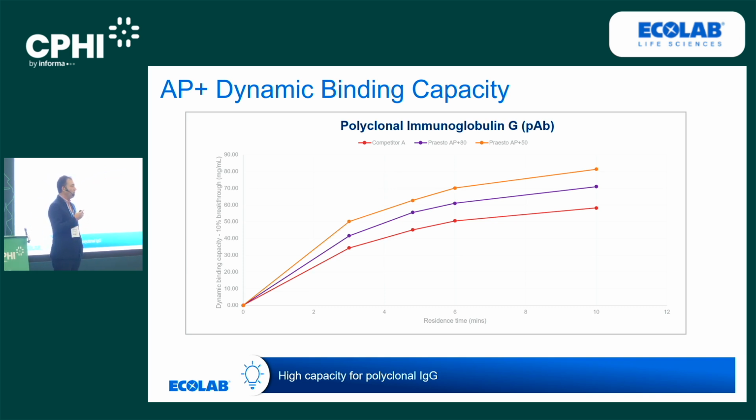Or how much of that protein can I recover later on in the elution? So we're talking about yield. Or for how long can I use that resin? That's lifetime. Another question would be, for example, how pure is the product that we can recover from that resin? That's purity. So we're going to be trying to answer some of those questions across the presentation.